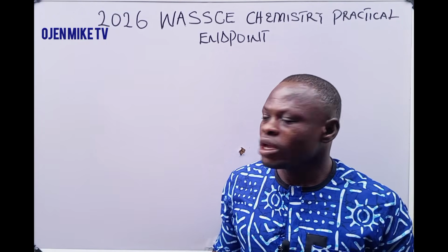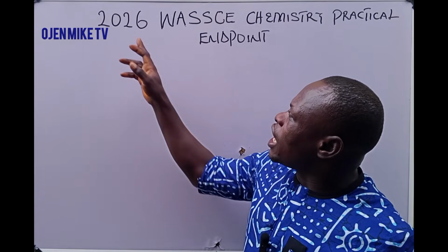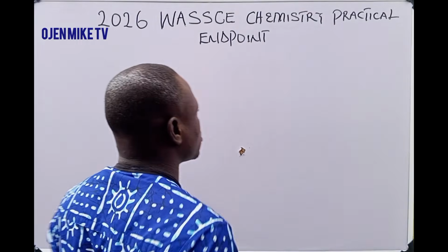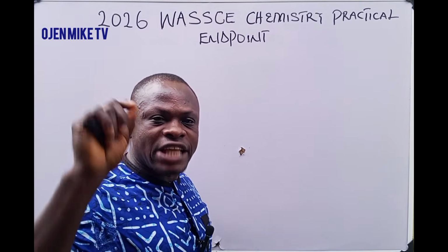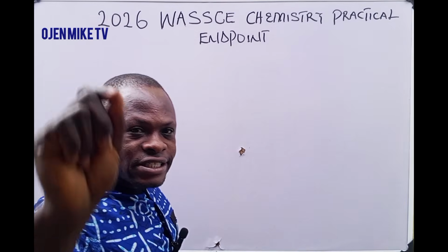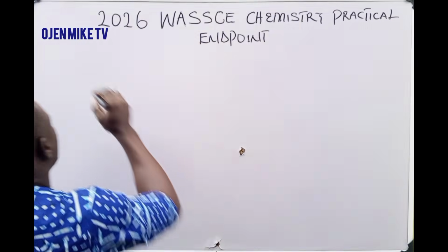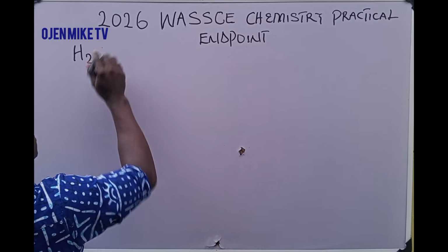Now, in our 2026 chemistry practical, we are given two major things. I'm only looking at the quantitative analysis, that is titration. Now we are given an acid and a base. What is the name of the acid given? We are given H2SO4.